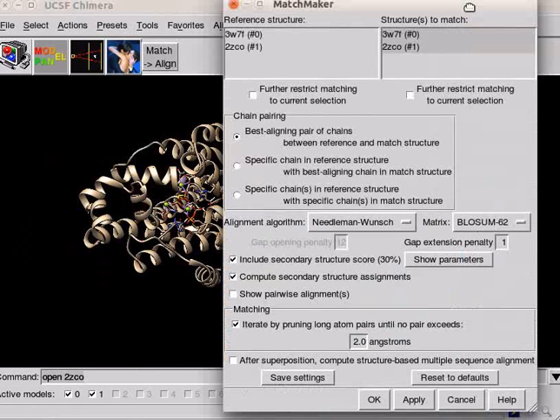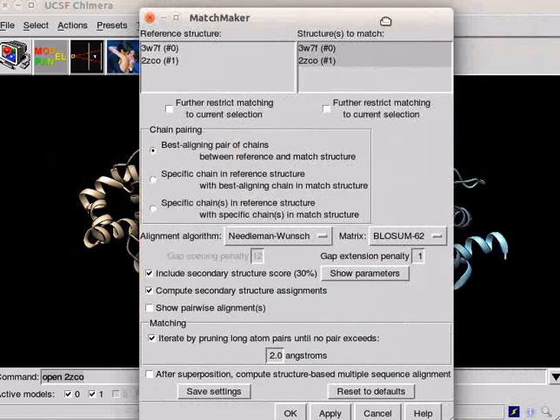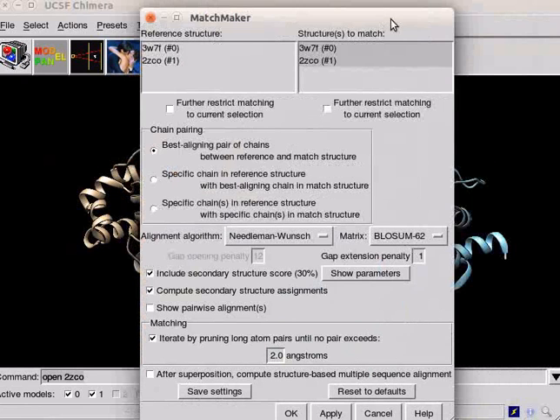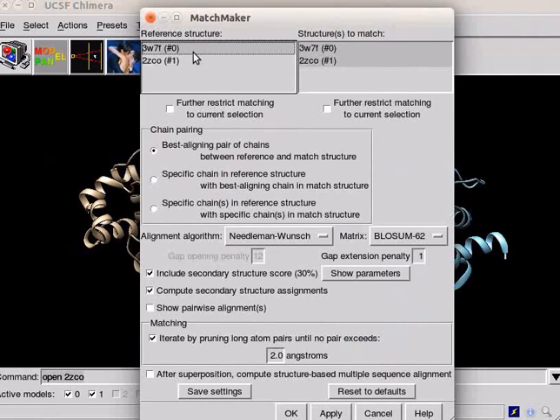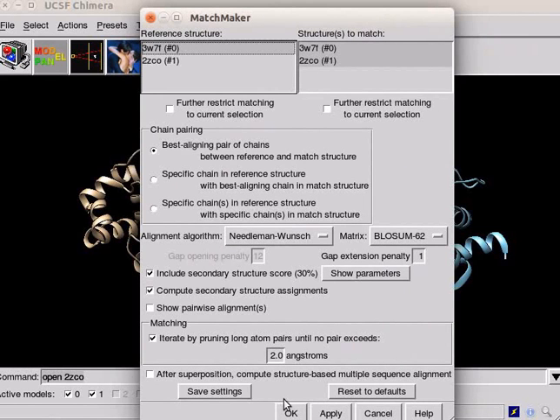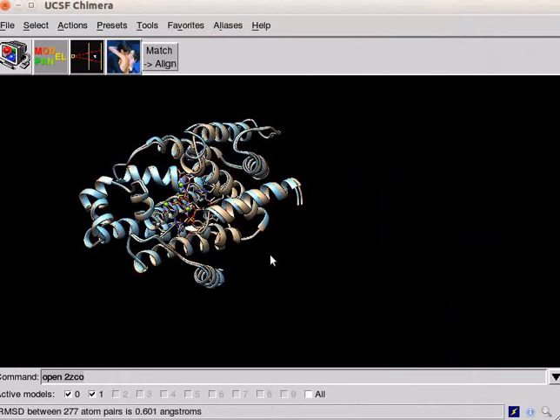A matchmaker dialog box opens. Click on 3W7F as reference structure. For now, let us continue with the default settings. Press OK button. Observe the panel. The two structures are superimposed on each other.